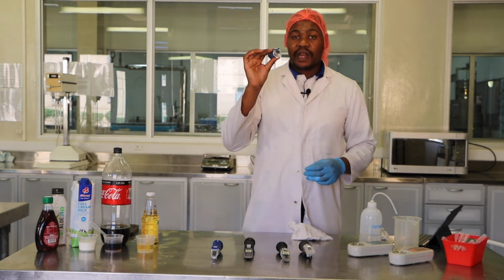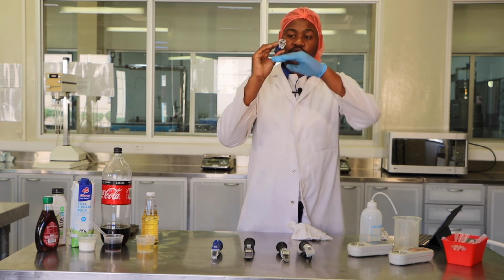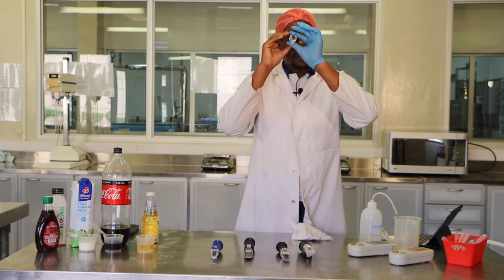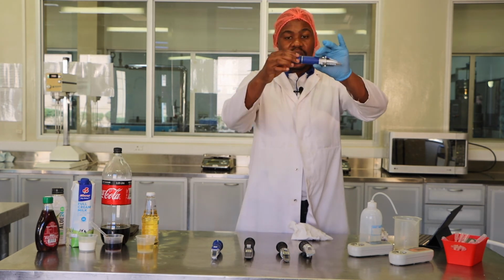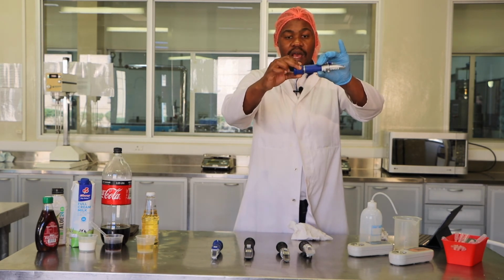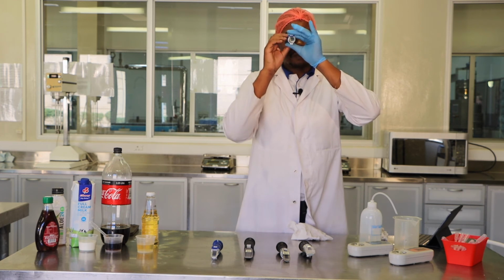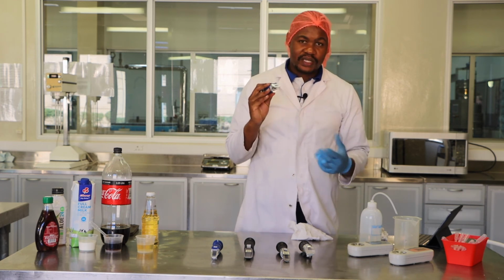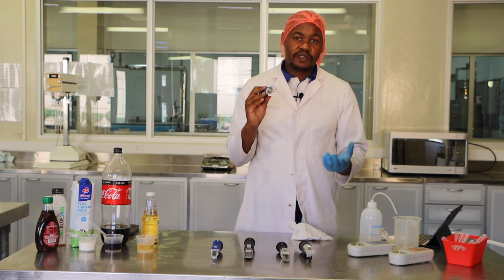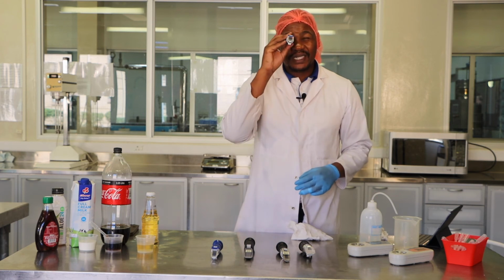What I just want to emphasize is that the handheld refractometer should always be held horizontally. You should always hold it like this, and here you can focus your refractometer to see the actual numbers. So fellow students, fellow foodies, good students, students of mine, please do not hold your refractometer vertically.